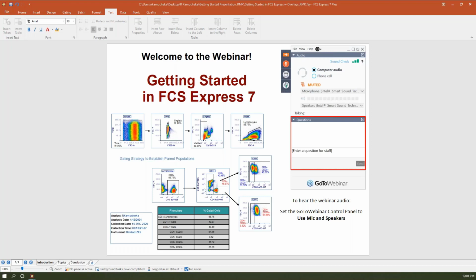FCS Express can provide the tools you need to analyze your data. Today's webinar is really a great start to exploring some of these features and capabilities and see what FCS Express has to offer you. So starting with FCS Express 6, we started taking a different approach to analysis. We wanted our users to have the ability to do the standard analysis that we're so used to, creating those plots and introducing those gates, but we also wanted to give you the capability to get presentation and publication ready quality reports. So our solution was this fully integrated analysis software package. When I move a gate, everything is going to update downline in real time. And since then, since we've established this integrated software pack, we've worked really hard to continue to make improvements, to listen to our users, and really introduce some of these new analysis tools and make the software easier to use.